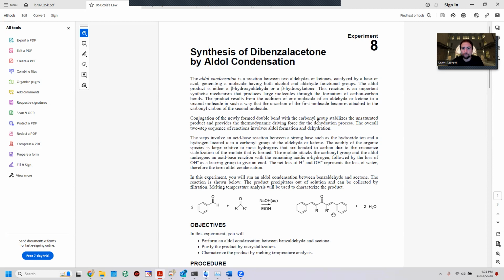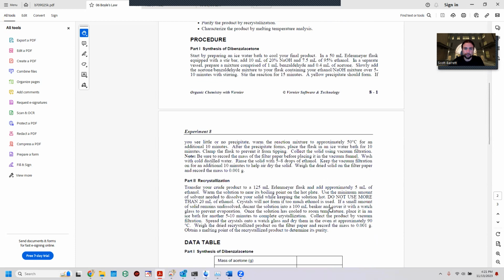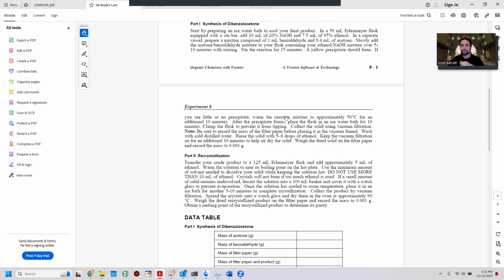So we're going to go forward and observe, here's the reaction, how you put it all together, and primarily having the 2-to-1 ratio of benzaldehyde to acetone. You slowly add it together, and then it's going to precipitate out. And you can review through how the reaction happens itself.